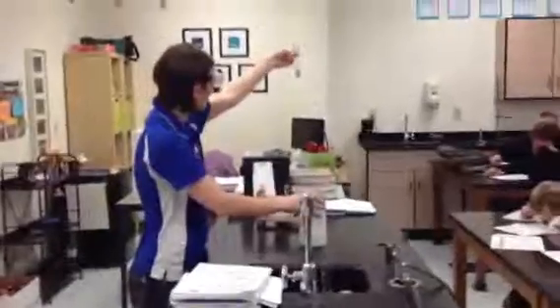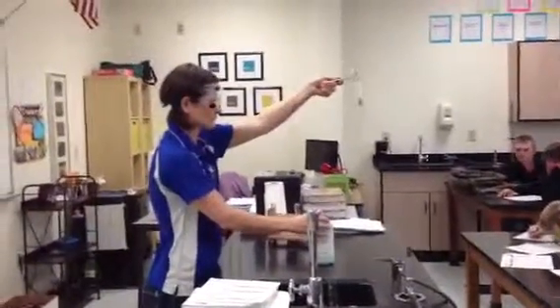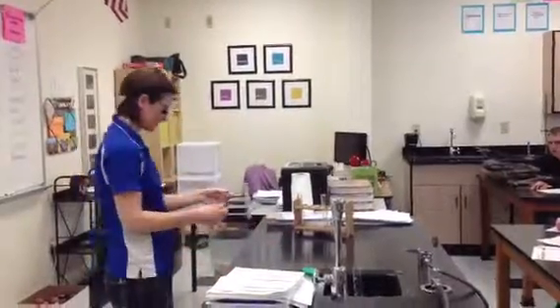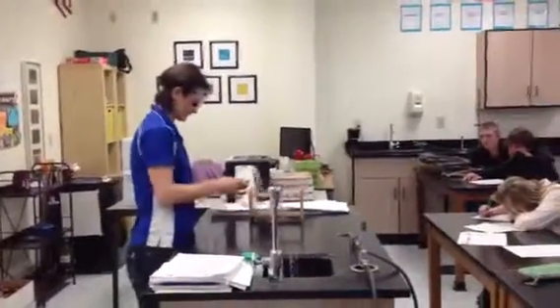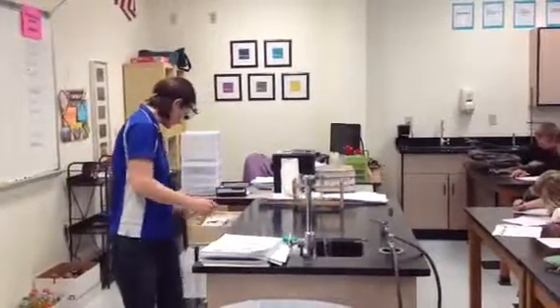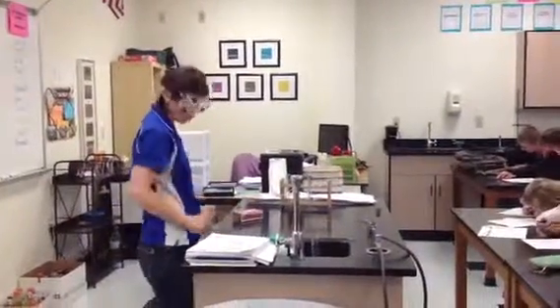Okay, I'm going to come all the way up, so here. There it is. Can you guys see that? Yes. No, Cody, you'll be fine. I won't let you die. Cody doesn't burn. I put bluish green powder. Bluish green powder is a good observation, that's fine. And the one with chocolate.